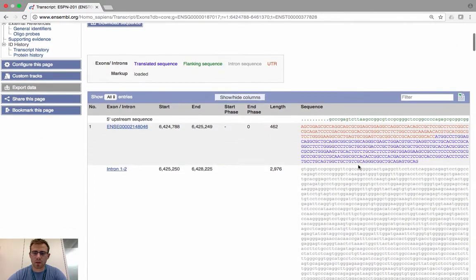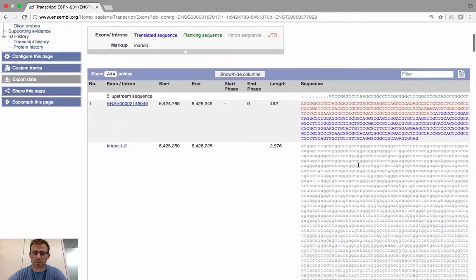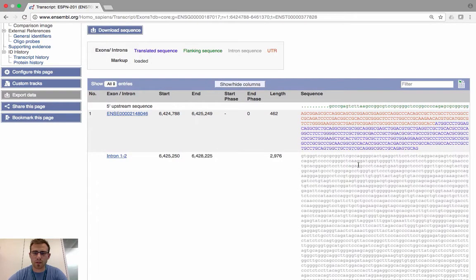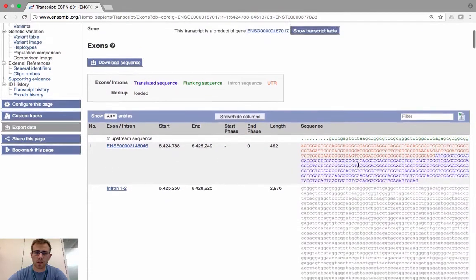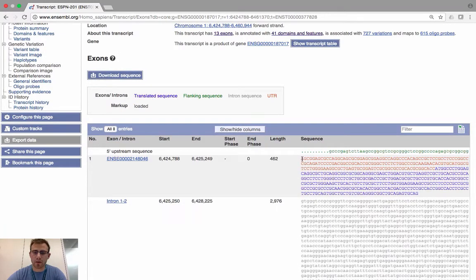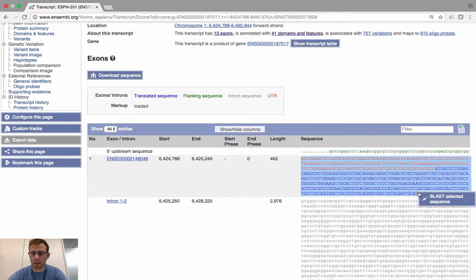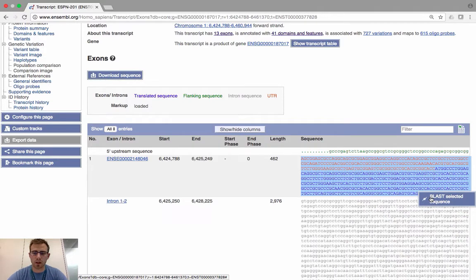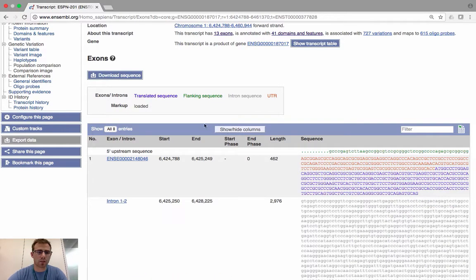You'll then be presented with the full intronic sequence. If you want to use this sequence, you have two options. First, you can BLAST the sequence — find a region of interest, highlight it using your mouse, and when you let go you'll be given the option to BLAST the selected sequence. Clicking this will jump you straight into the BLAST tool so you can use it in your sequence searching analyses.